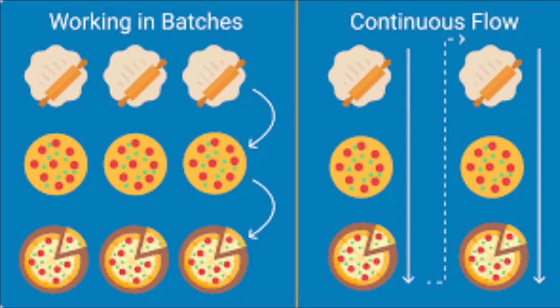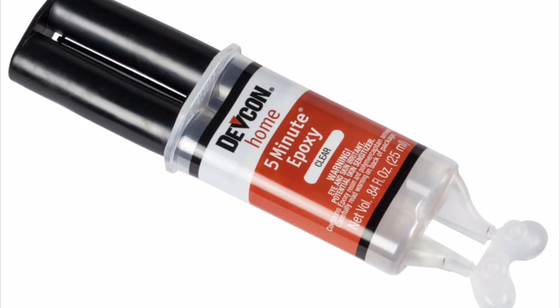An example of how continuous manufacturing is used in everyday life is two-part epoxy. The two different chemicals are mixed only as you push the syringe, creating the exact amount that you need. What this looks like in a chemical synthesizer is instead of having to mix each chemical in one at a time, you can simply press a button and have the mixture of your choice created before you in a continuous flow. Although our chemical synthesizer is not quite this streamlined, it operates under the same idea.